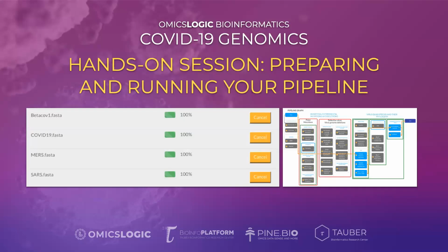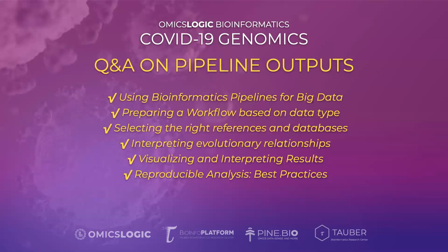Then we'll have a hands-on session where we'll take those concepts, where to find data, how to compare the different data, and what pipelines to run. And then we'll talk about the different sections where you can do different types of analyses. We have these different sections that we've prepared that you can try and play around with, and they will provide you visual and specific outputs that you can learn from.